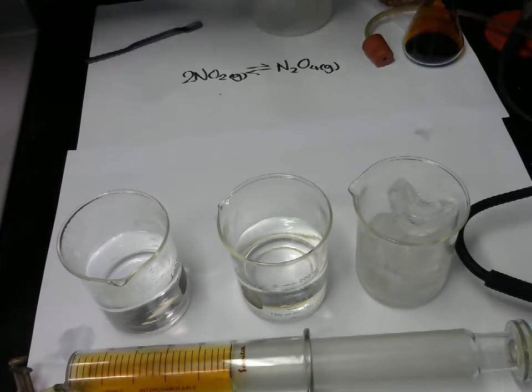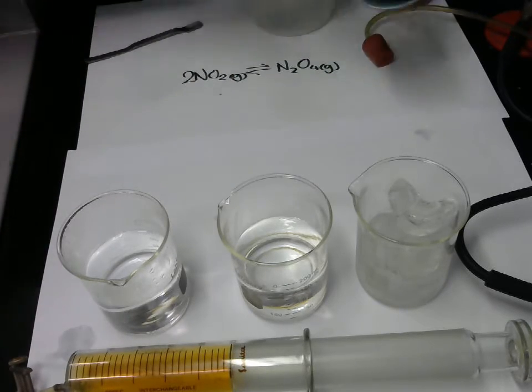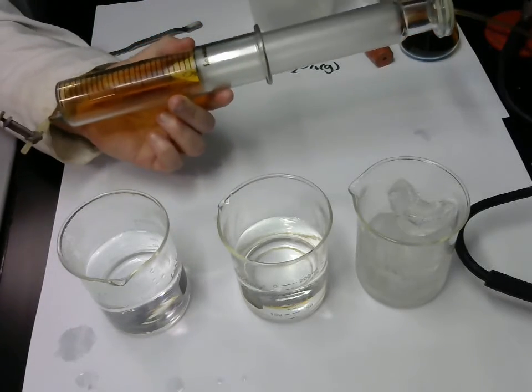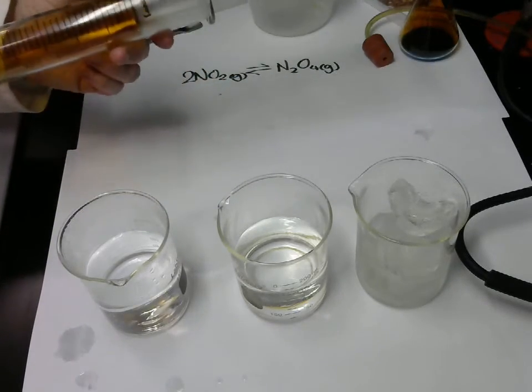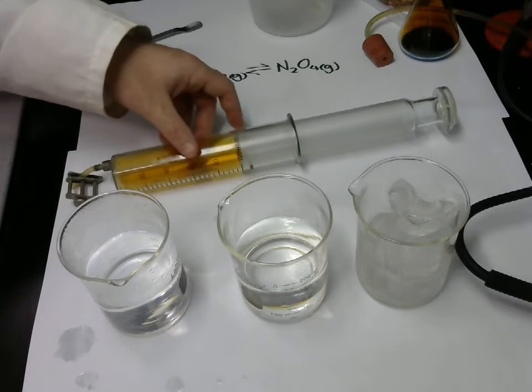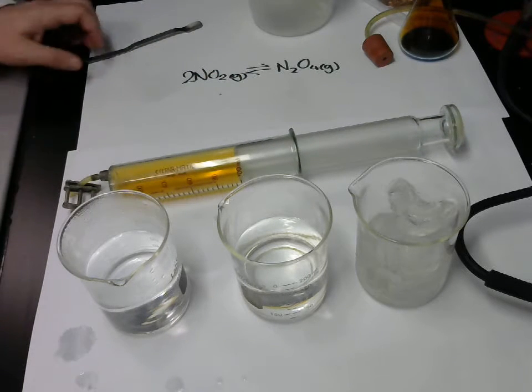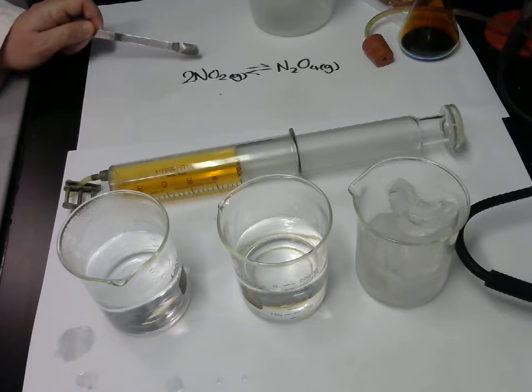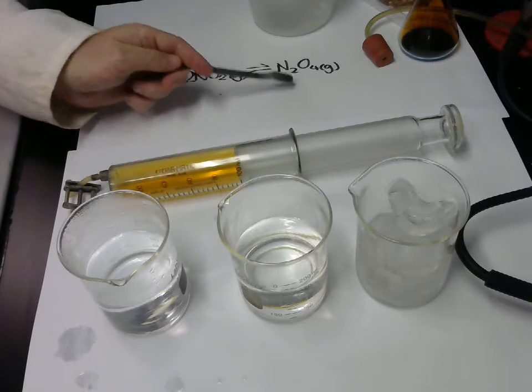The nitrogen dioxide gas we've seen is a brown gas. We've collected some of that into a syringe. The reason for that is, being a gas system, we can have a look at the effect of pressure on an equilibrium. If we have a look at the reaction, we can see that on the left hand side we've got 2 moles of gas particles, and on the right hand side we've only got 1 mole of gas particles.